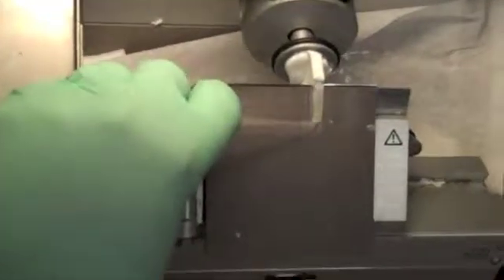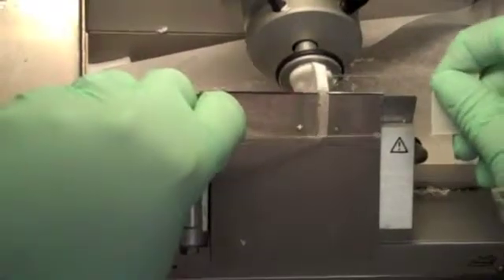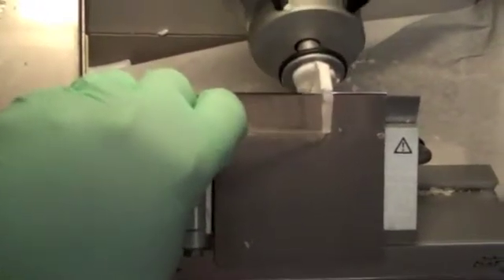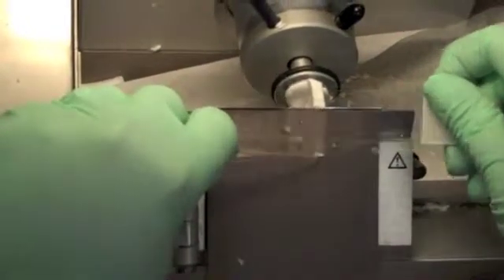Using either a brush or a curved glass pipette, carefully guide your section straight onto the platform. Place your slide gently on the section, and it will melt right onto it. Continue aligning sections on your slide. Be careful not to overlap any tissue.